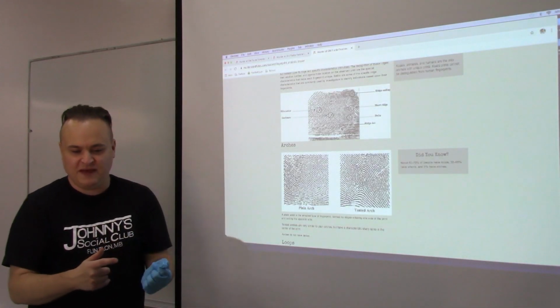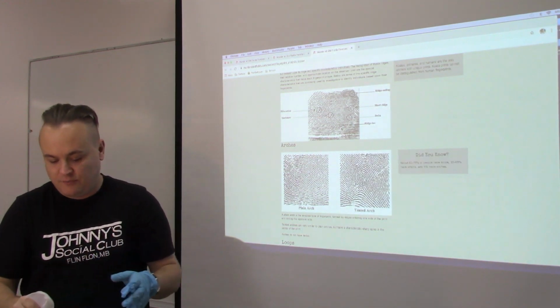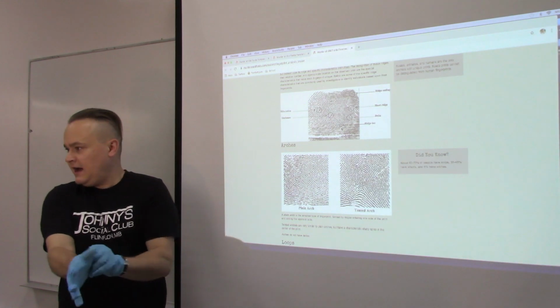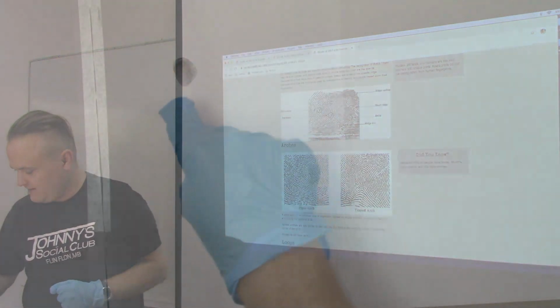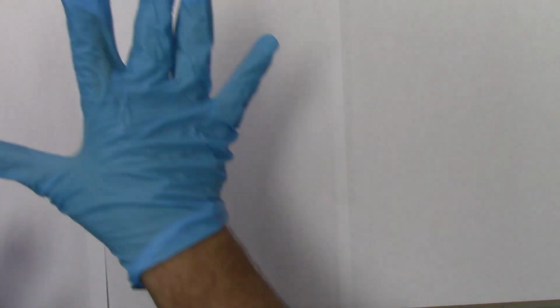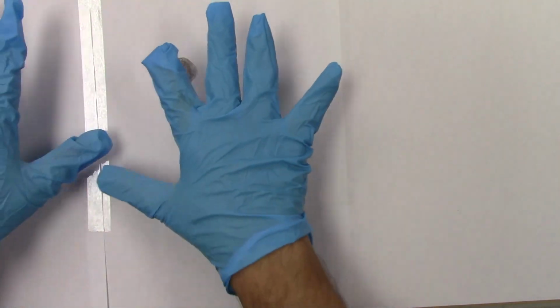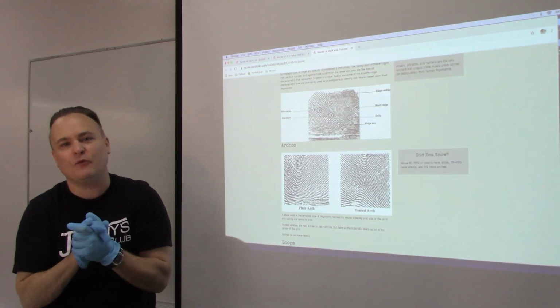Say you were being investigated for a crime. I'm just going to wipe that off because it leaves a terrible mess. Say you were being investigated for a crime. I'm going to put this back on because there's a bigger mess coming. They would take you into the police station, and they would do prints just like that. They do it for all your hands. You'd have a print sheet, thumb, first finger, second, third, just like we have in the booklet. For all the suspects and victims. Same kind of thing. So you would come in and you would do all your prints. That's taking a print. That is one of the lab activities that they suggest we do. So we might do that if we have some free time where we can all print each other.